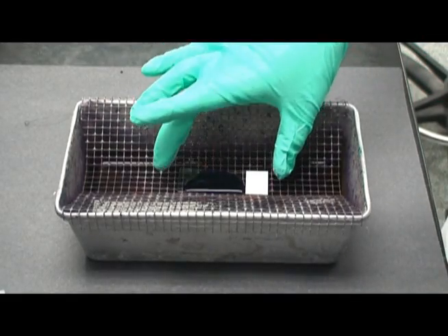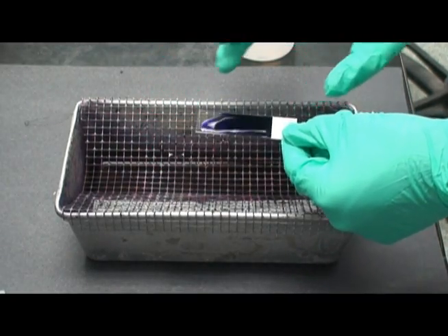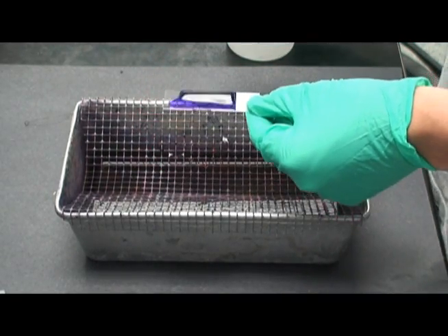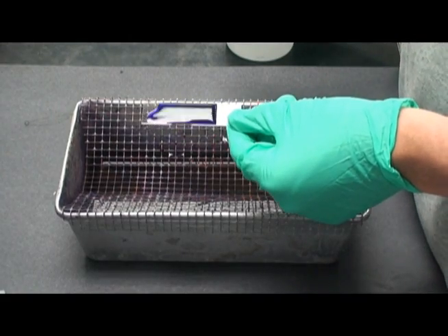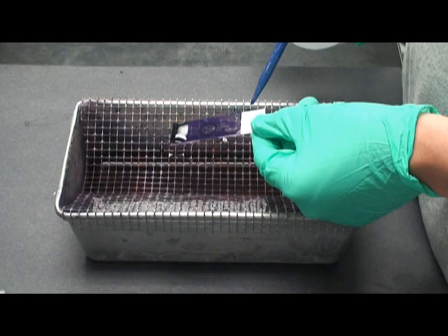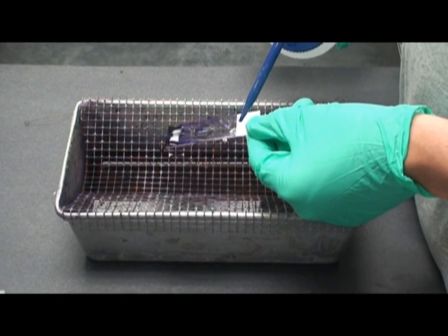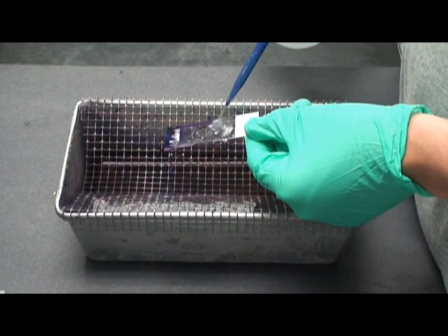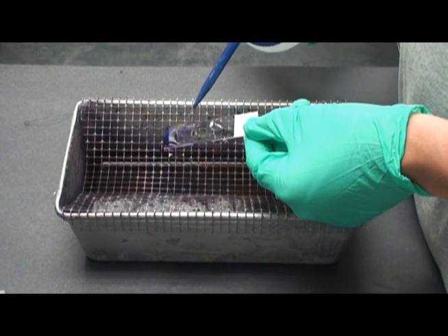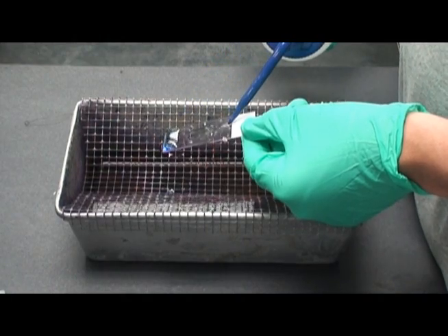Gently wash the slide with water. Proper washing technique for a microscope slide is shown here. A gentle stream of water should be applied to the tilted slide, taking care not to spray directly onto the bacteria as this may wash away the bacteria. Continue washing until stain no longer drips off the microscope slide.